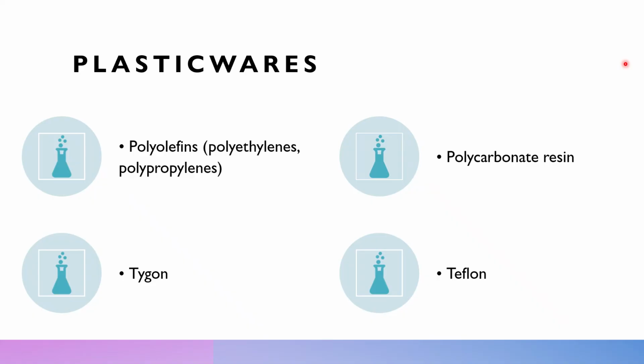This means immediately rinsing glass or plastic supplies after use, followed by washing with a powder or liquid detergent designed for cleaning laboratory supplies, and several distilled water rinses may be sufficient. Also, pre-soaking glassware in soapy water is highly recommended whenever immediate cleaning is impractical.